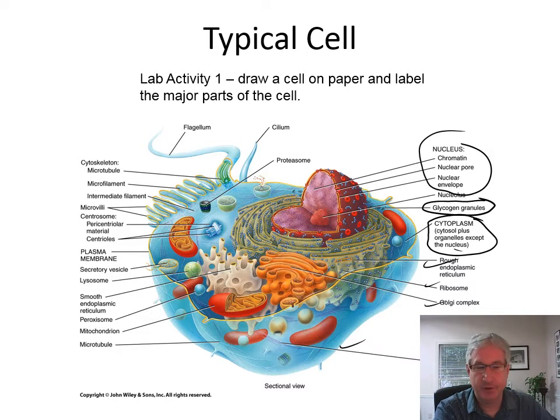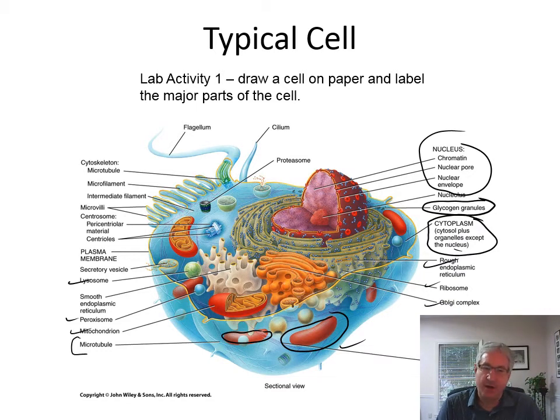Microtubules, and we'll talk about those here in a second. Mitochondrion is these kind of kidney-shaped things here. Here's one. Here's another one here. Okay. And we have peroxisomes, and we have lysosomes probably around here somewhere. There's lysosome. Those are two things that break down.